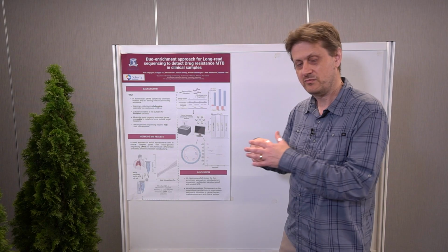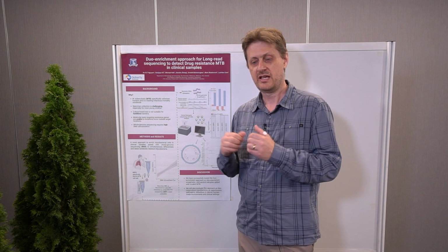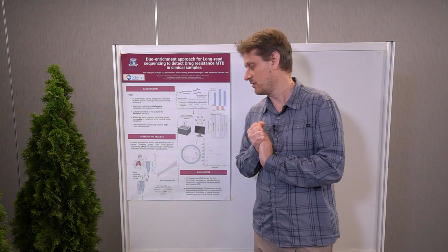We have also designed a customized streaming bioinformatics platform which carries out the mapping and identification of variants from the stream of data that comes off the nanopore sequencer. We like nanopore sequencing both because it's a very portable sequencing approach, but also because you get data off the machine almost immediately as you start sequencing, in a data stream, and we process that data stream in order to identify the presence of antibiotic resistance mutations in our data, and also to predict the lineage and the strain.